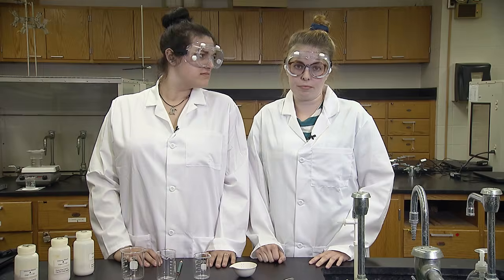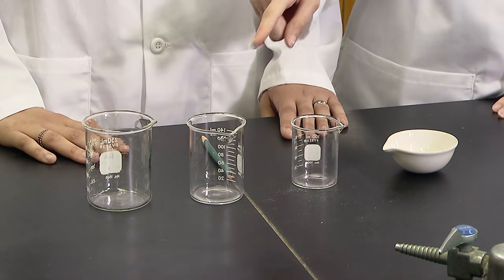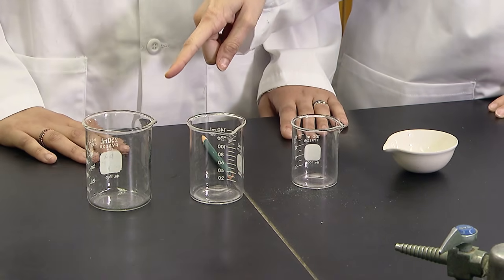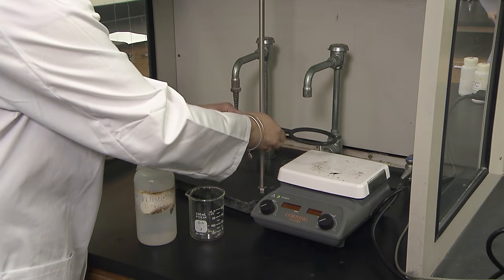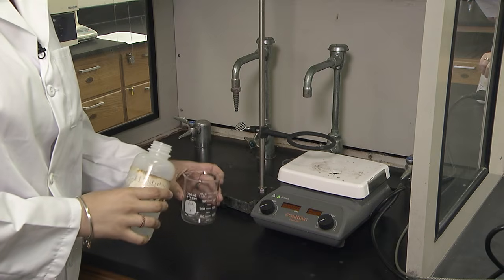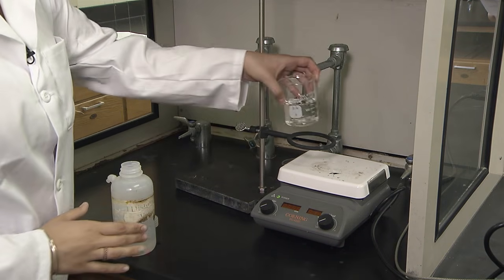Where do we start? Take out the evaporating dish, the 100 milliliter, 150 milliliter, and 250 milliliter beakers. The 250 milliliter beaker is used as a hot water bath. Adjust the ring stand, making sure to leave room on the hot plate for other beakers. The ring clamp will stabilize the hot water bath. See the How to Handle Hot Glassware video for more detail.